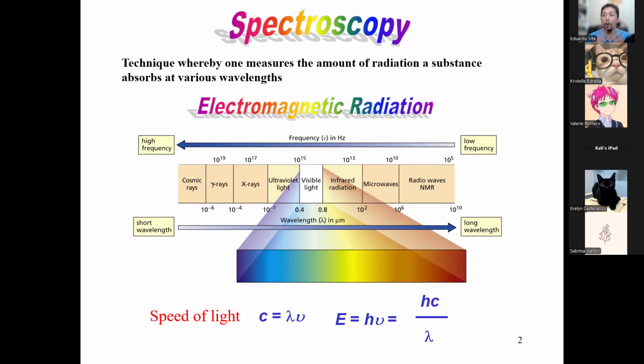And then we have all sorts of wavelengths because light moves in a wave, and the wave can be a very long wave, and the wave can be a very impossibly short wave, really small. I mean, think about it. Light is in nanometers. So anything shorter than that is going to be way smaller. So there's a huge spectrum of electromagnetic radiation. We can only see 300 nanometers, and that's it. So everything you see, all the colors in your room, the colors of your clothes, your eyes, all the art that you've ever seen is only that tiny little sliver of the entire electromagnetic spectrum.